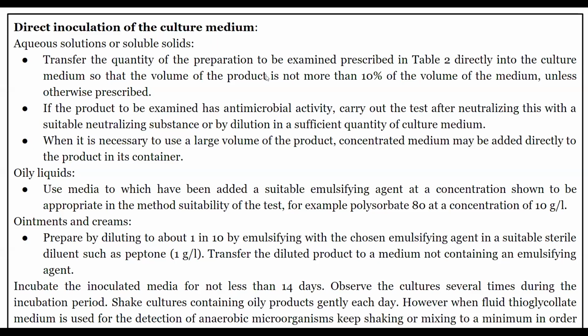and then go further with the incubation as explained under aqueous solutions or soluble solids. For ointments, again, you can dilute it by adding emulsifying agent and then put it into the diluted medium not containing any emulsifying agent. So in oily liquids, you can have emulsifying agent in the culture medium, whereas in ointment and cream, you can dilute it with the emulsifying agent and the culture may not contain any emulsifying agent. So the oils, ointments and creams get mixed properly into the culture medium and the result obtained will have appropriate interpretation. So after this, incubate the inoculated media for not less than 14 days.